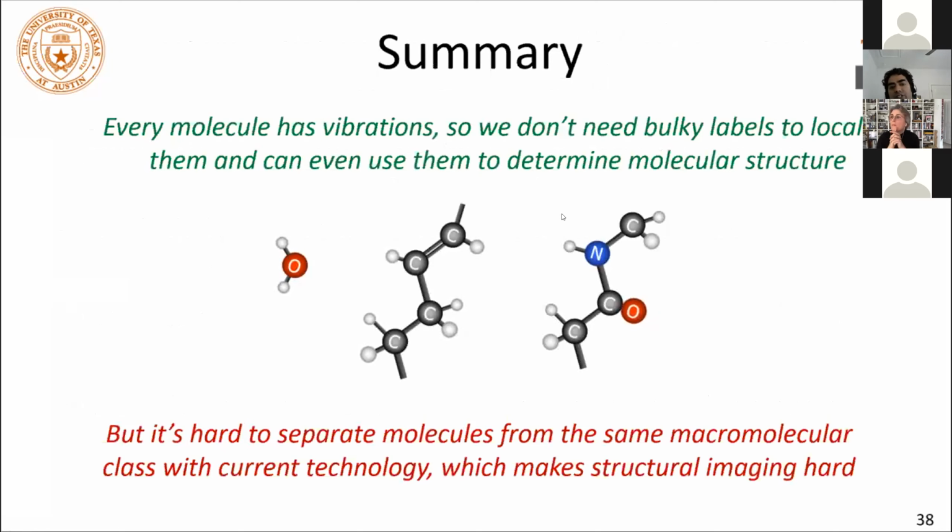So, okay, to summarize this, right, you have vibrations for every molecule. So you don't need bulky labels to find them, but it's really hard to find these molecules inside of cells of interest without small labels.